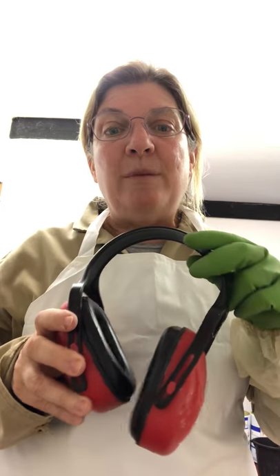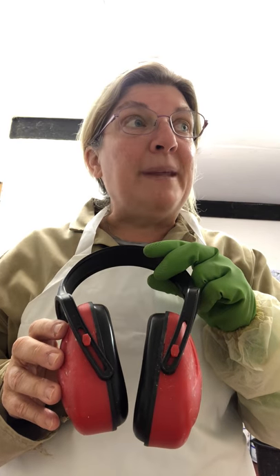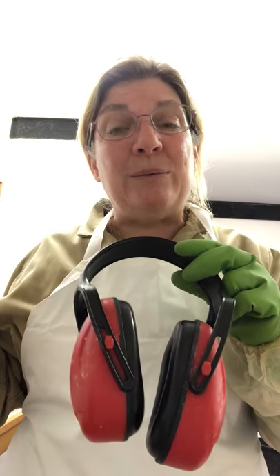No one really likes to have to wear ear protection, but this is the only thing that will do. The little foam earplugs just do not do it — they tend to pop out, they don't knock out enough noise and they fall out. Depending on how many are working, each student really should have their own pair of ear guards.